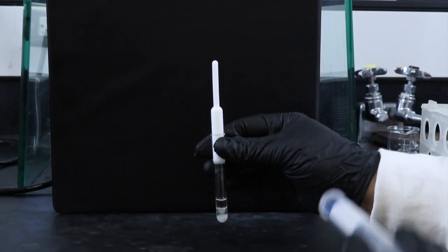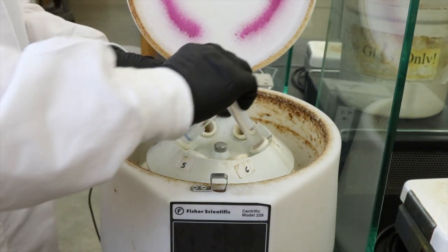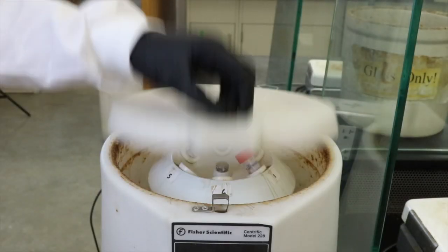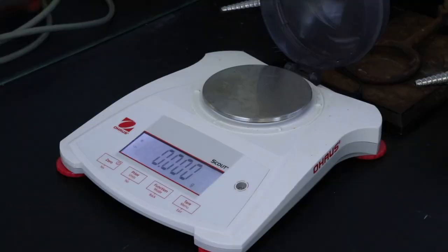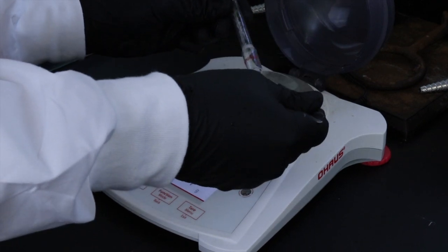I'll separate the crystals by using the stopper and polypropylene test tube again, and then place it into the centrifuge and allow it to run for a few minutes. I'll weigh out the purified acid crystals now so that a percent yield can be calculated.